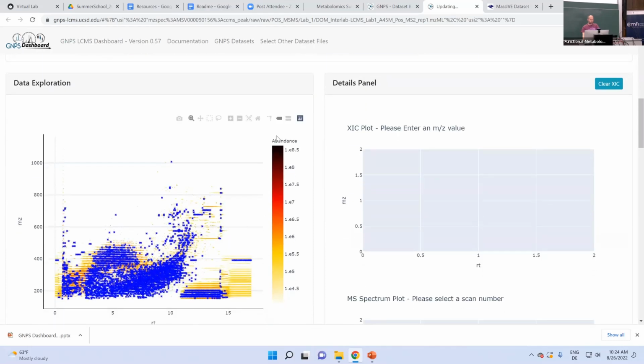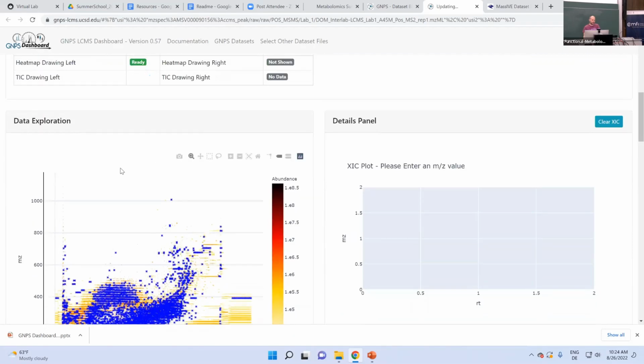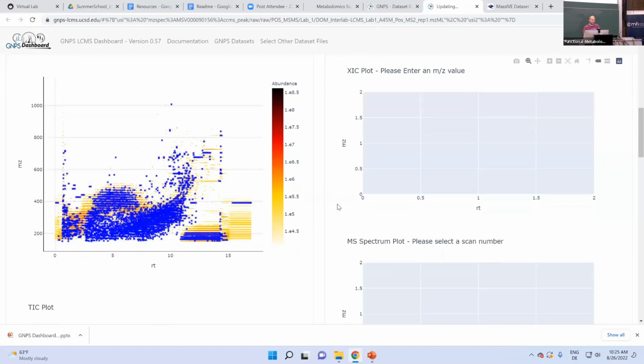So it should happen right in there. Because a lot of people are hitting it in parallel, it might take a little bit longer than usual. Normally it should just take a couple of seconds to reload. Once it's loaded, there will be ready signs here, and you can see it now established already that heat map I talked about.